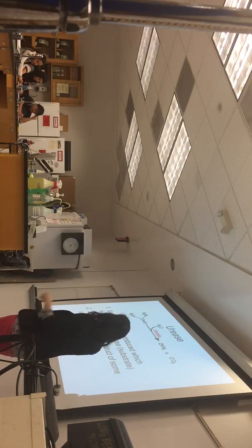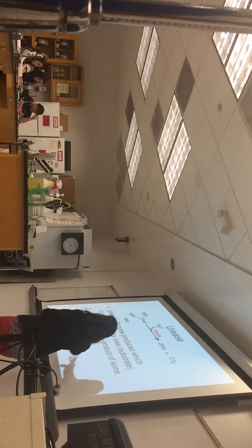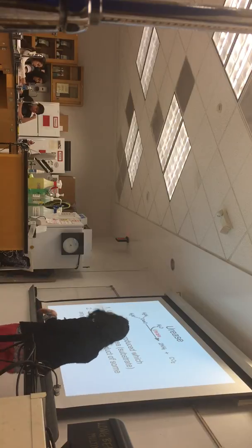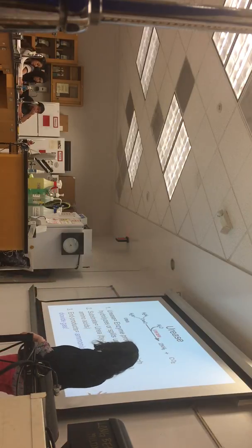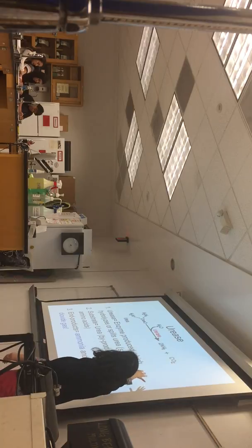So in the disc that they use for diagnosing peptic ulcers, there's also urea in there, just like how our agar has urea in it. And what's really nice is when the urea is broken down, you only end up with two end products. Ammonia is the first one. Carbon dioxide gas is the other.